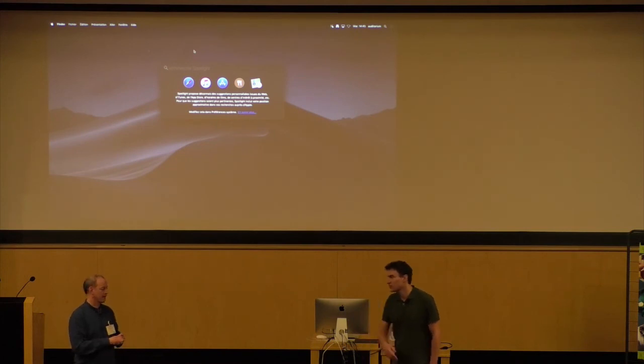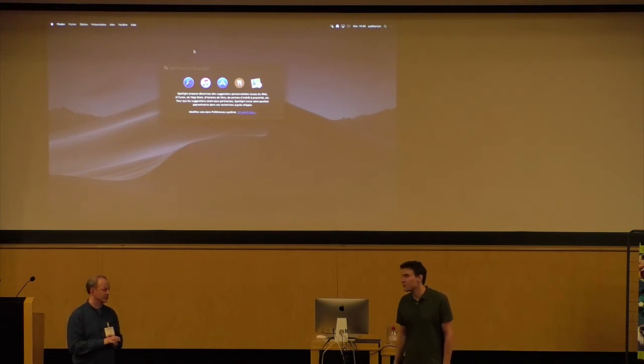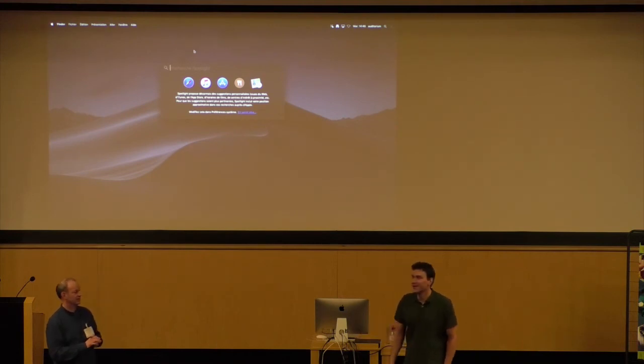I do different conditions and then I do screening. And in the meantime, I have some experience. Even with the cameras, you already see sometimes, okay, this one was completely dry or this one was much too thick when it was done. So after doing hundreds of grids, you can even see in the camera and by feeling and already tell, yeah, this one was a good one.